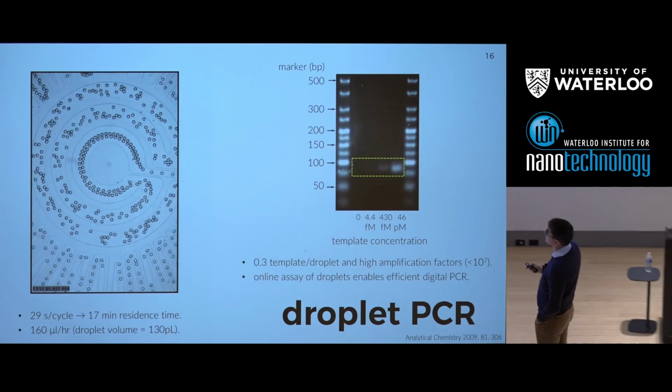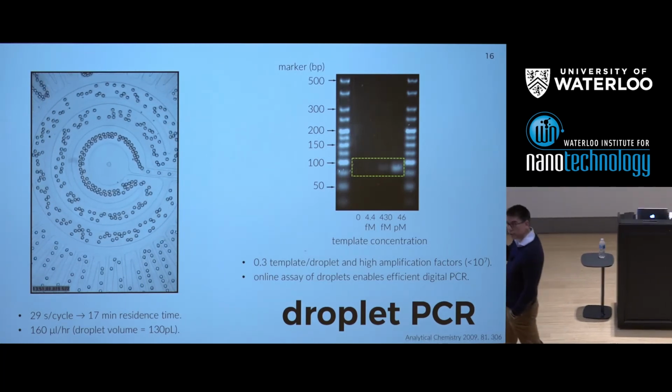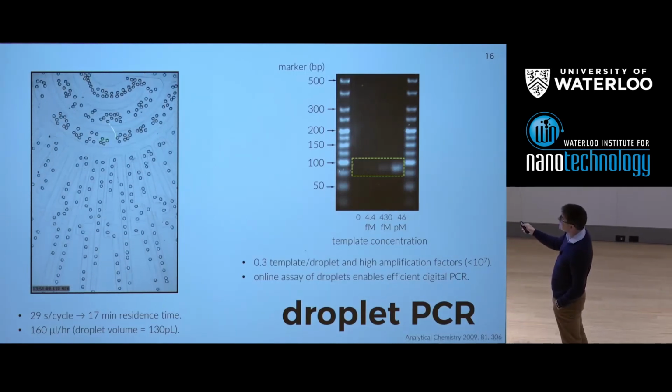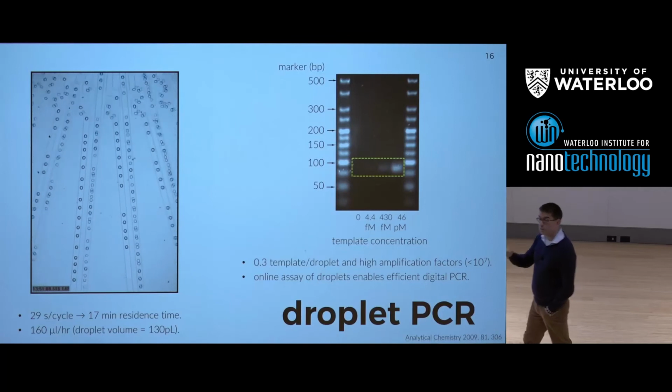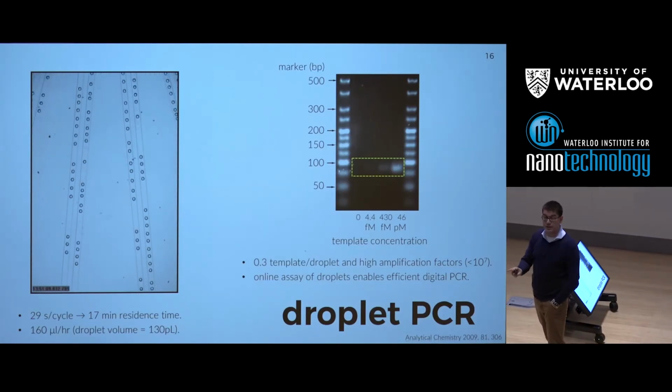So then if you look at a video here of the droplets being formed, you can see what's important. The idea now is our reagents are encapsulated within the droplets. They don't see the surface. And that means that in theory, our efficiency should be nice and high.